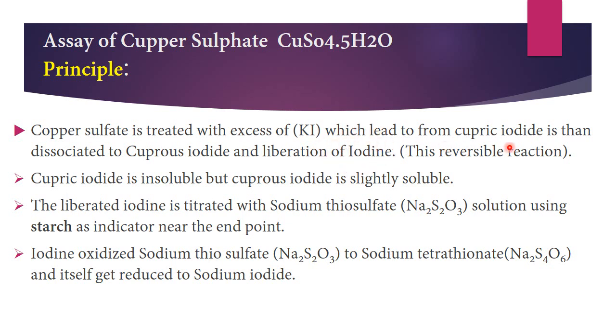هذا الرياكشن راح نعتبره reversible reaction بسبب شنو؟ إنه الكبريك iodide is unstable. And بالإضافة إلى instability of cupric iodide, it is insoluble but cuprous iodide is slightly soluble. زين. هسه تحول الكبريك iodide إلى cuprous iodide وتحرر الأيودين. هاي بالخطوات الأولى من التفاعل.